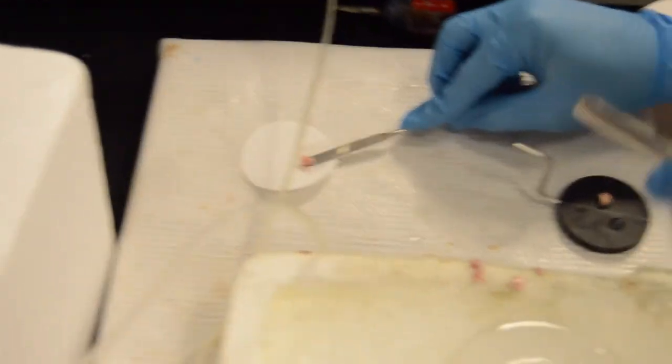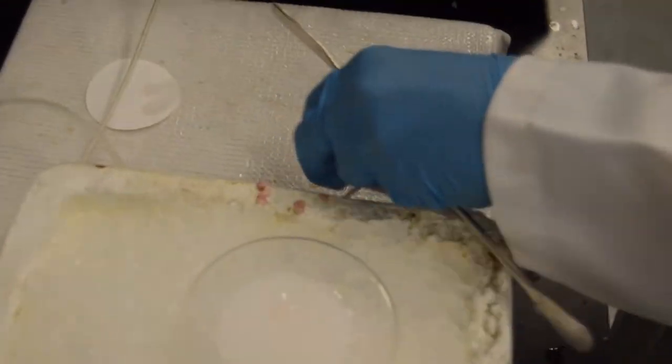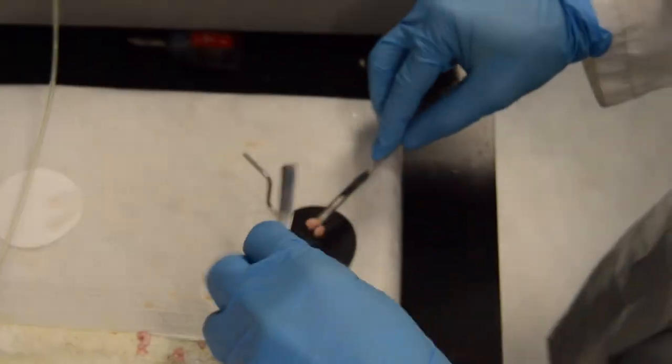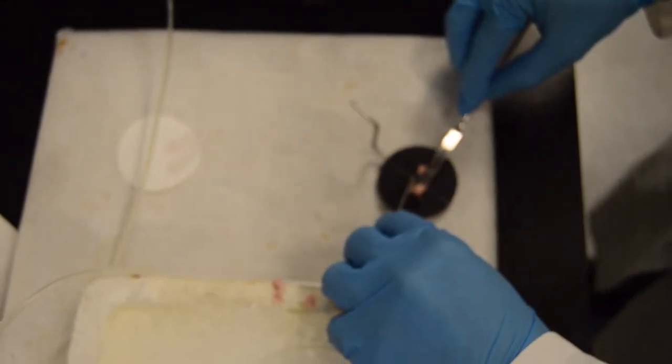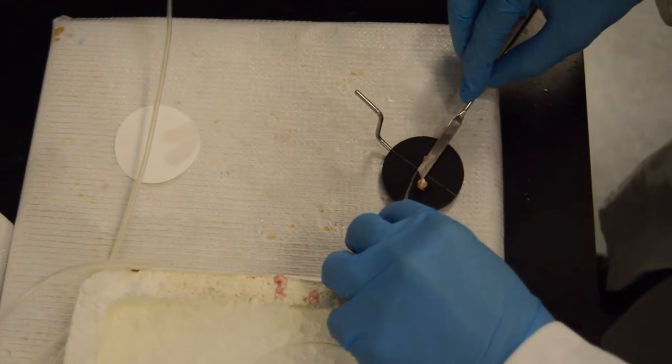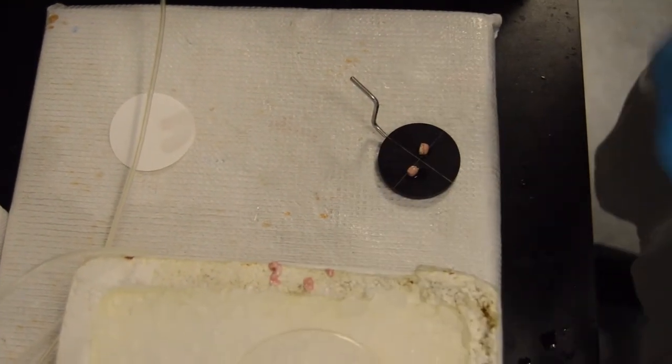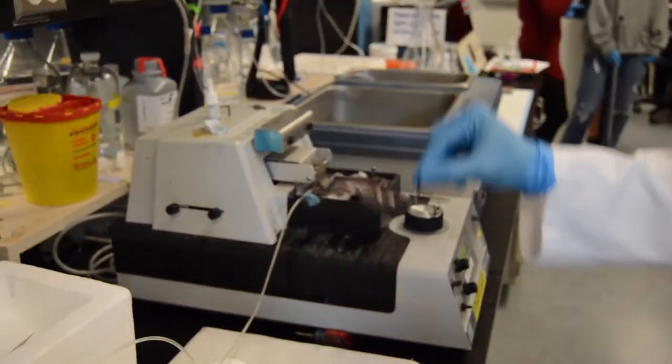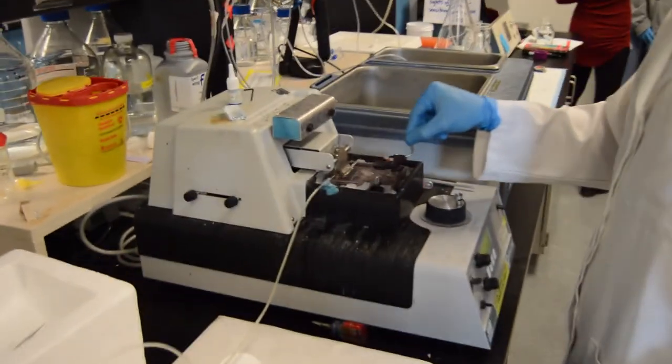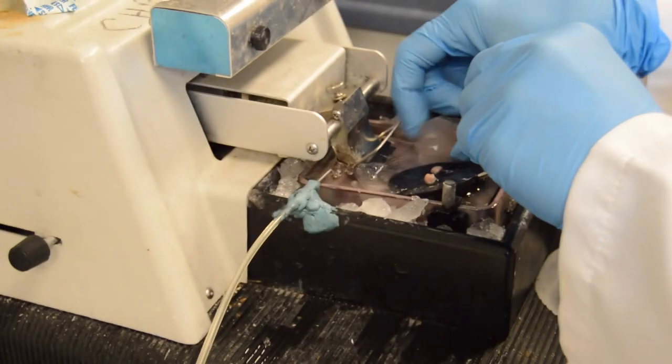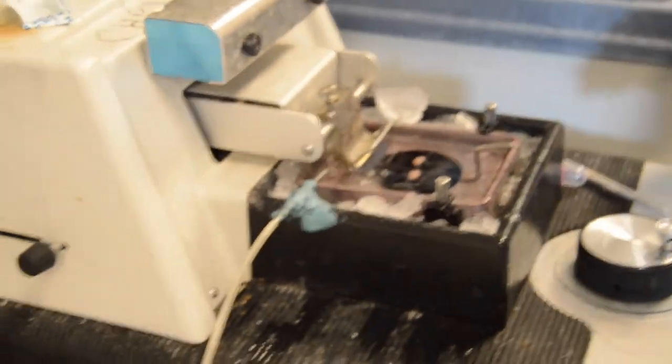We then transfer each cerebral hemisphere to a dry piece of filter paper before putting the cut dorsal surface onto the glue of the chuck. We are very careful to ensure that the hemisphere is placed onto that cut side, so that it isn't knocked out of orientation. We then allow the glue to aerate and dry, and place it into the chamber of the vibratome.